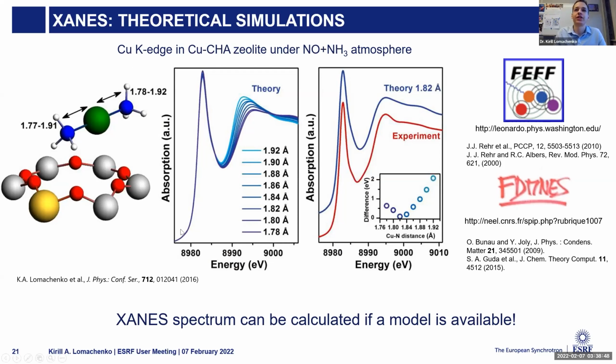And of course, the possibility to calculate spectra and to link the spectral shape with the values of structural parameters is now heavily exploited by different machine learning techniques. The more powerful the computer becomes, the faster you can calculate the spectra, the more spectra you can calculate. And then you have big data, and you can analyze it by different machine learning algorithms. That's now a very hot direction, and it's developing very fast, which is very good.